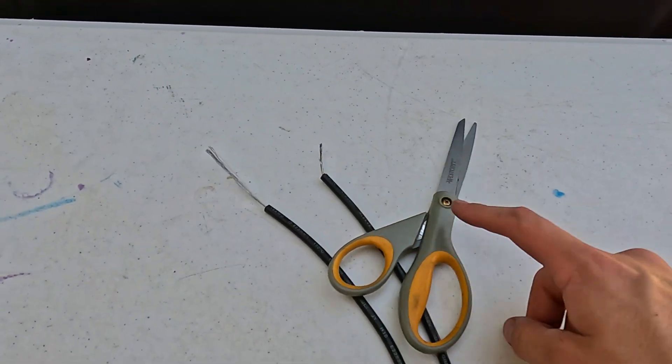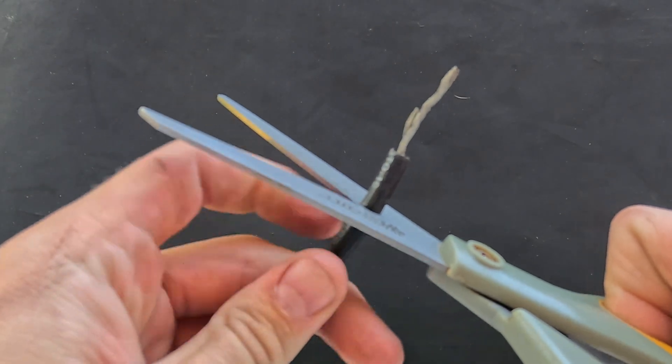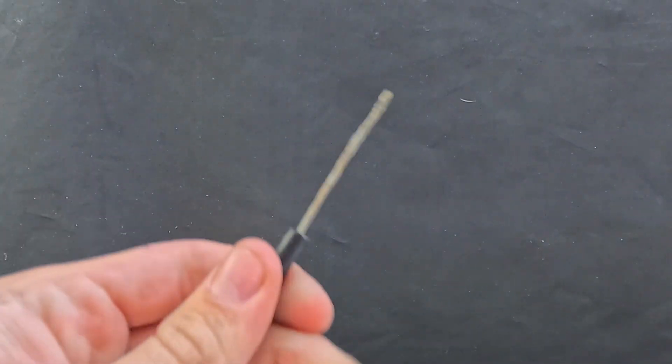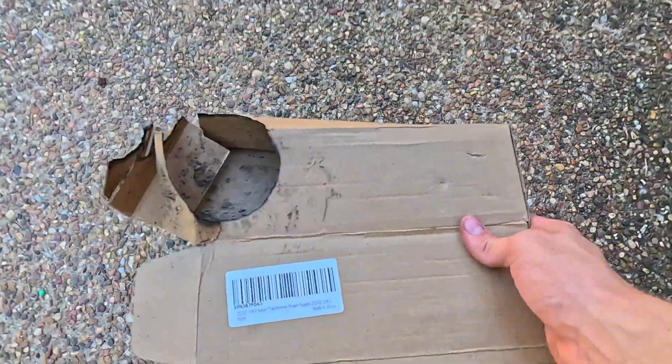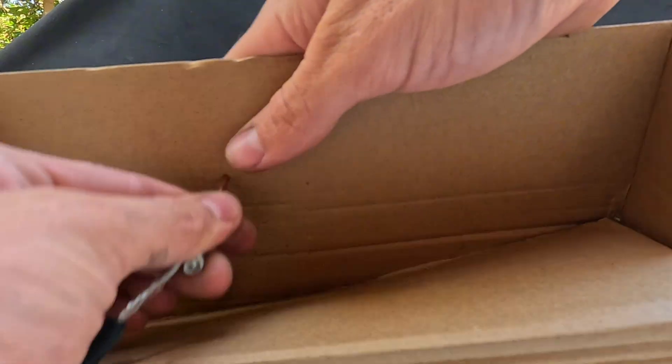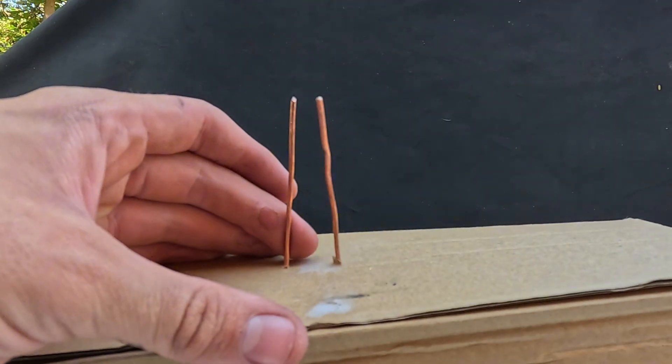Before it's usable, we're going to need to strip the wires. You can actually do this with scissors if you do it carefully — simply cut in a circle around the wire, making sure not to cut the wire, then pull off the rubber. Now we're going to find a way to bridge the arc between these two pieces of copper. Grab some cardboard, wrap the wire around your copper wire, then stick your copper wire underneath and through a piece of cardboard, keeping them about an inch apart.